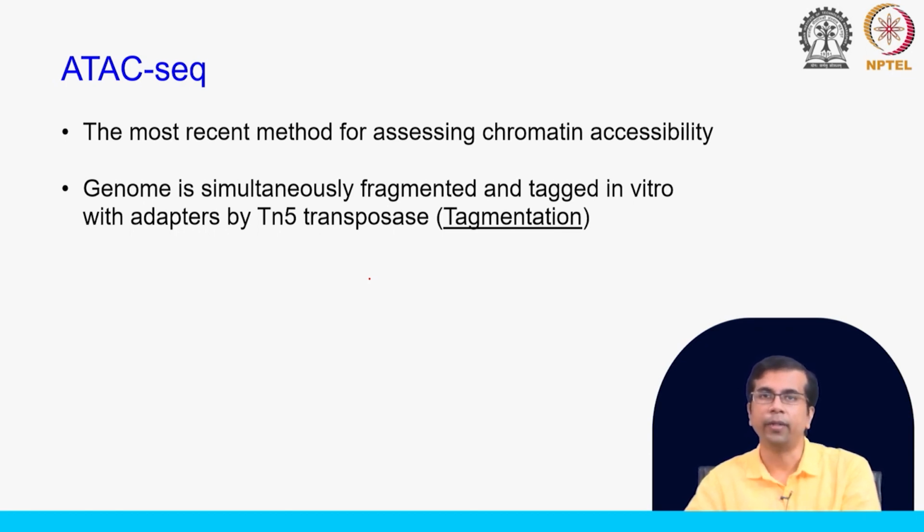So, this is part of the transposons, which actually insert DNA in the genome. You can utilize that property by inserting adapters, the NGS adapters, into the genome. These transposases insert these adapters and also fragment the DNA. That is why this is called tagmentation: you have fragmentation plus tagging. That is tagmentation.